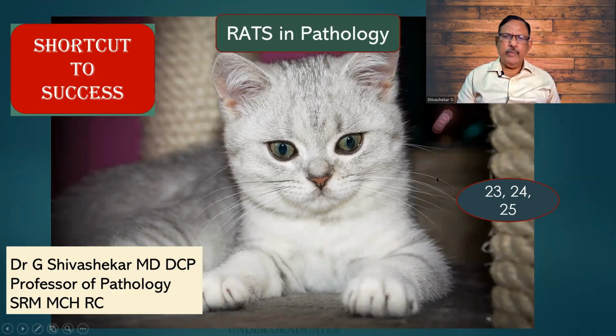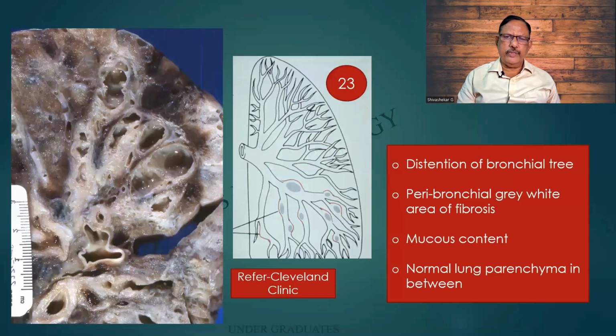And these will be the number of spotters that we shall be covering. Spot the spotters. This is a specimen. Rather, you should describe it as a mounted specimen, in which I am able to see a lot of blackish discoloration. That means it's a lung because of anthracotic pigmentation.